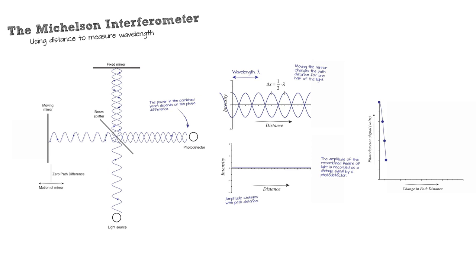Well, let's see, we get nothing. That's the signal that's reaching the detector. It's completely canceled out. So if I measure it, what do I get? What if you measure? You get 0, right? So we're going to measure it and we're going to see what we get here. Oh, we get 0. Now I'm going to move it a little bit more.